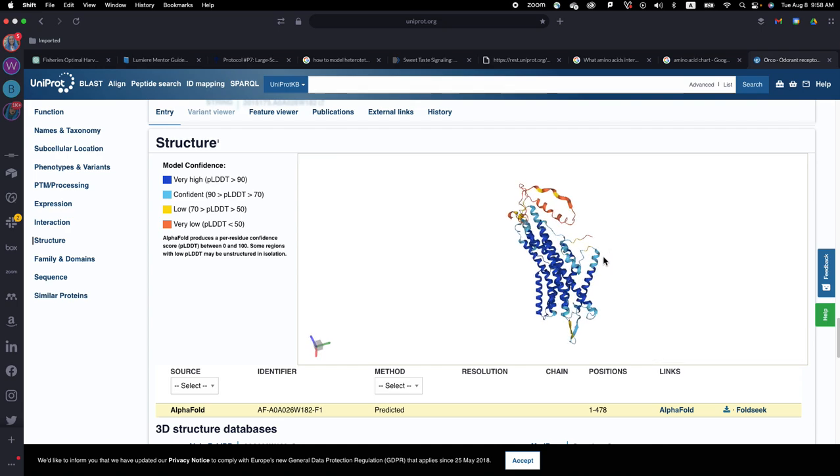So how these proteins come together is this helix right here comes together like 4 times. And then because it's got this flexible area up here, that's the channel that the ions flow through. So when your complex comes together, you'll be able to see something more clear of, okay, this looks like something that ions would flow through.